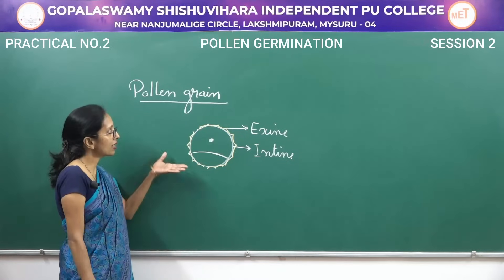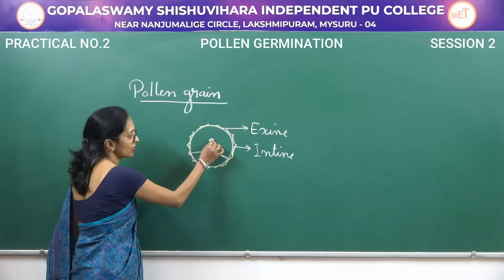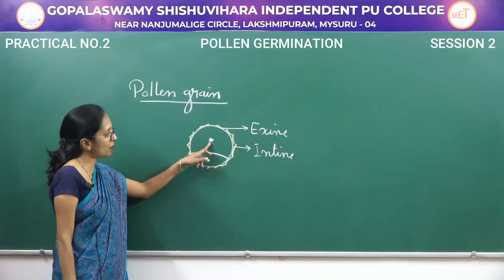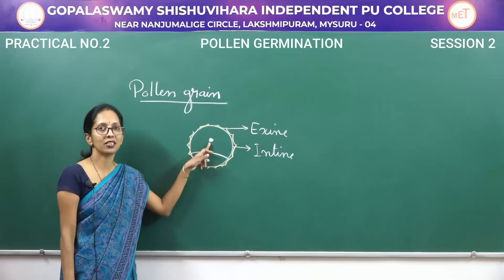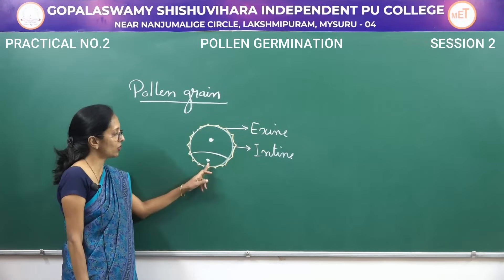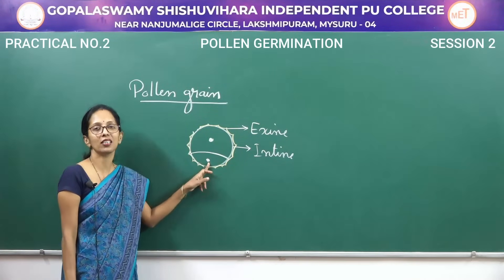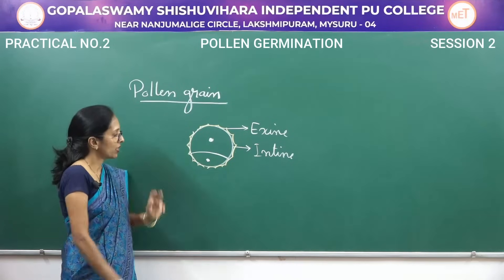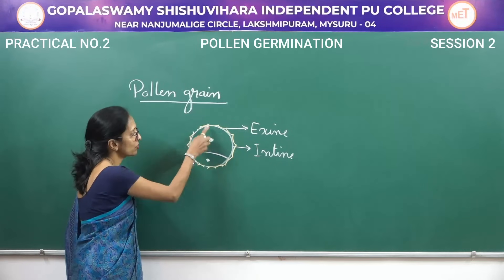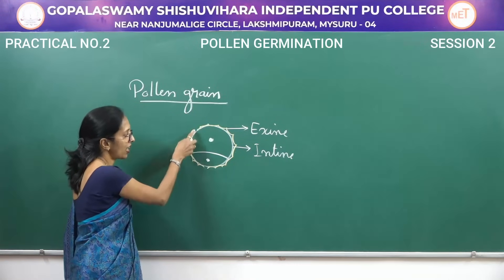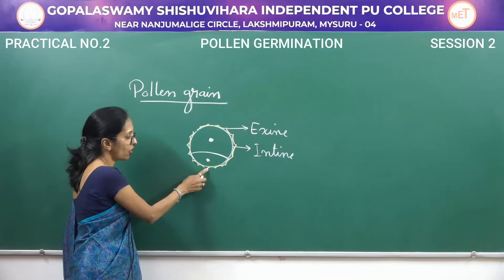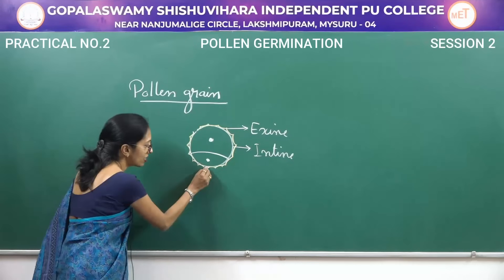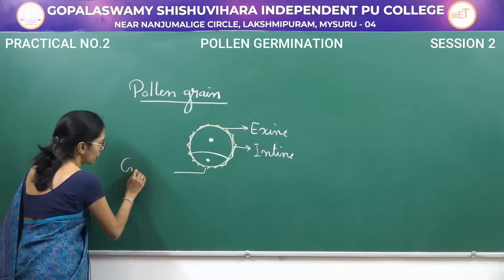Inside the pollen grain there is a presence of two cells. The upper one is said to be the vegetative cell and the lower one is said to be the generative cell. There are some places where there is an absence of exine, and this part is said to be the germ pore.